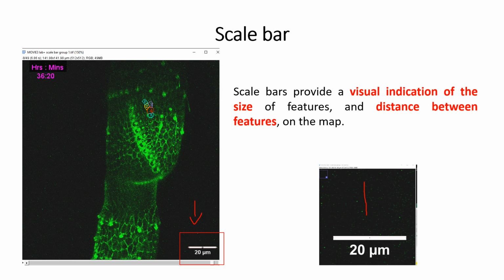Here you will have your scale bar, and if you watch the other video, the guy described very well how to use the scale bar. I will just zoom in. Okay, sorry. Zoom in very well when you do that because it makes your measurement better. If you do it when they are very small, it's much more difficult. You can miss, or you can make it too big or too small, and this can change your results a little bit. Here, maybe you know that this is hours and minutes. So here, for example, is 36 hours, 20 minutes. So these two things are very important.